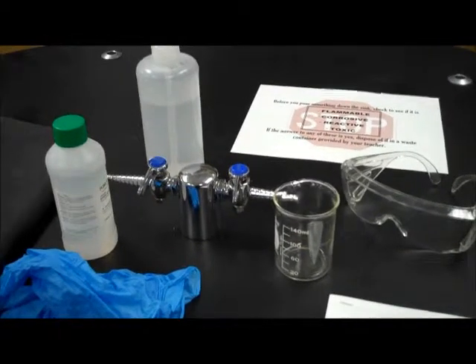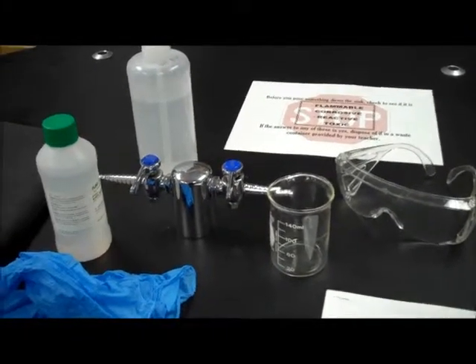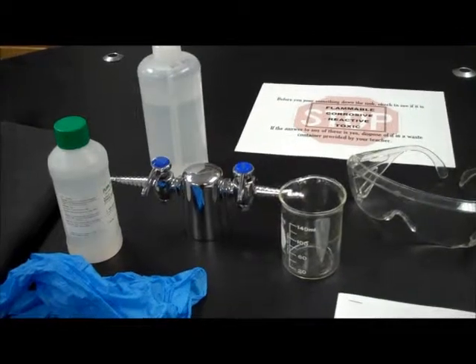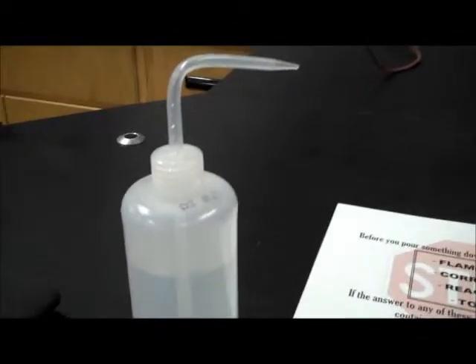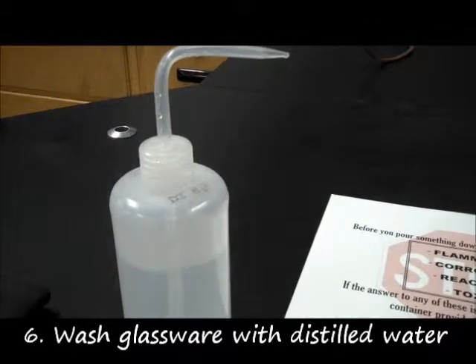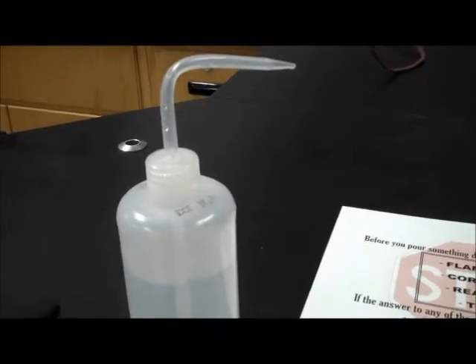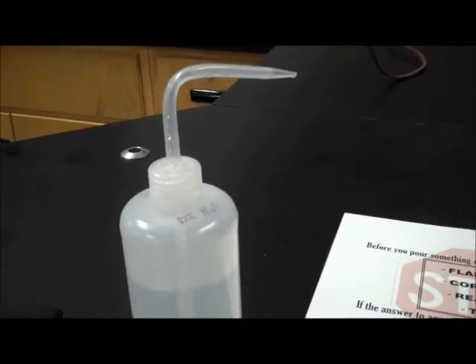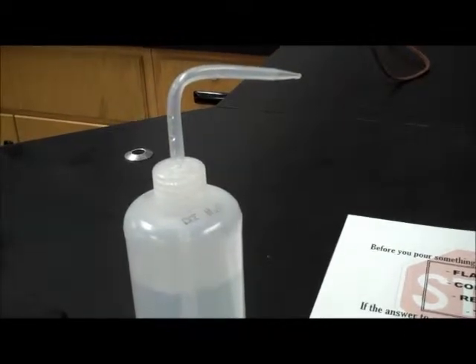Now, at the beginning of the lab, I will give you instructions about how to dispose of chemicals. So just listen to those directions and follow them when you get ready to clean up. When you're cleaning glassware like this beaker, it's important that you use distilled water in a spray bottle like this. You're going to rinse it with distilled water because that will keep the glassware from spotting. Distilled water is pure, and tap water out of the sink will leave minerals deposited on the glassware that could react with chemicals when we use them the next time.